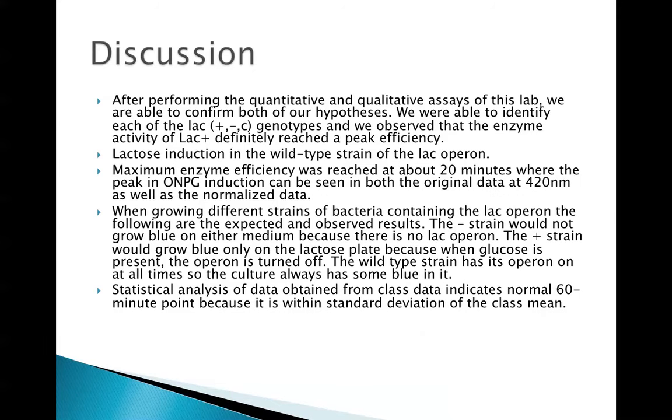So this lab was a quantitative and qualitative study of the activity of the lac operon in E. coli. After performing the quantitative and qualitative assays of this lab, we were able to confirm both of our hypotheses. We were able to identify each of the lac genotypes on the plates, and we observed that enzyme activity of lac positive definitely reached a peak efficiency.